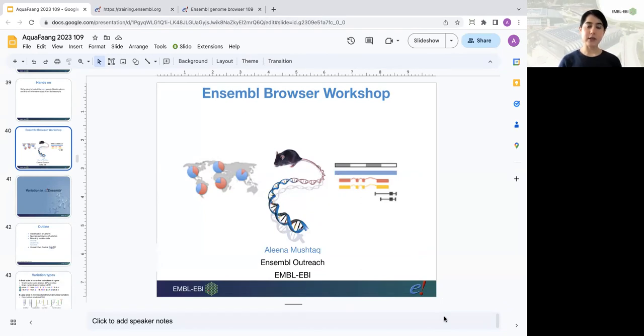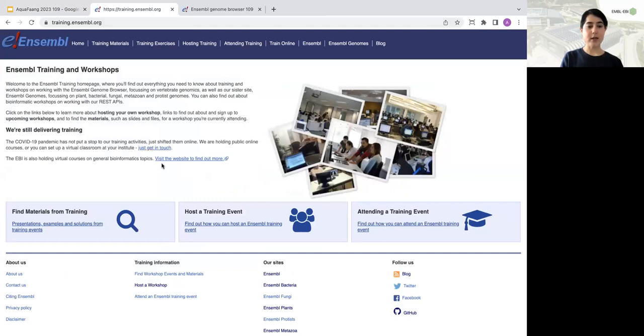And then I will talk to you about VEP, which is a tool that you can use to annotate your own variants. And then later on in the afternoon, we're going to talk about comparative genomics and BioMart. So just to recap, all of the material for this training session, you can find on training.ensembl.org.